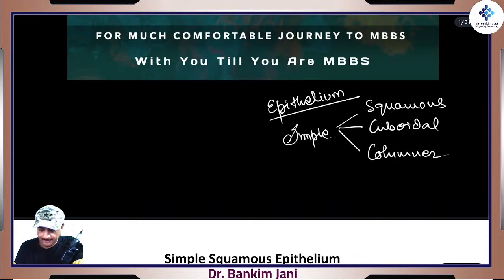Okay. Now all the images you are about to see are histology images, and I'll share these images also. They are from the same slides which I am having, right? I have taken the pictures of that only. So what you'll see is like one slide.